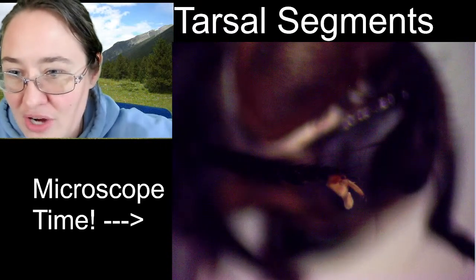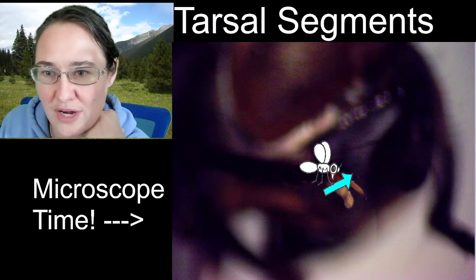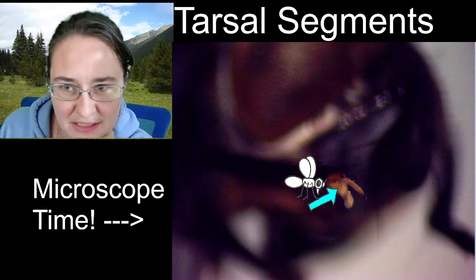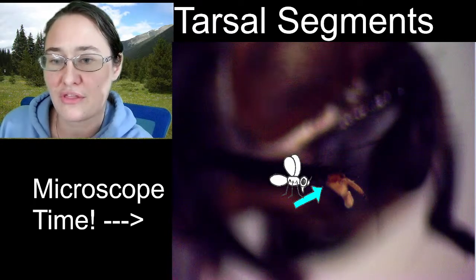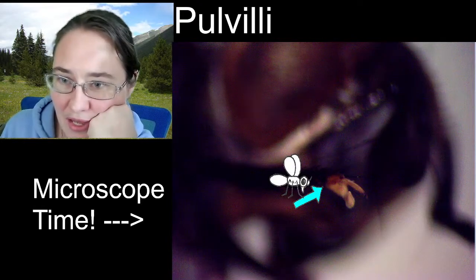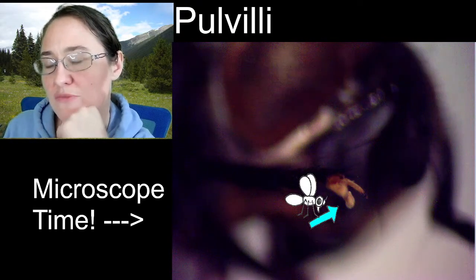Okay, so I'm trying to get this to focus all right, but what we're looking at is not the fly's head. So don't mind the fact that that is all blurred out. What I'm looking at is right about here. This is the tarsal claw at the very end. Right here and here, those are sharp, those are the tarsal claws. But underneath the tarsal claws, flies have pulvilli. And these are essentially toe pads. So if we look right here and here, those additional two little pieces, those are the little toe pads. They exist underneath the tarsal claws.